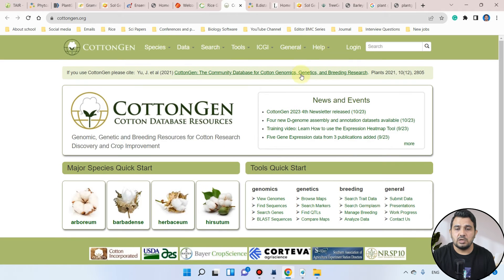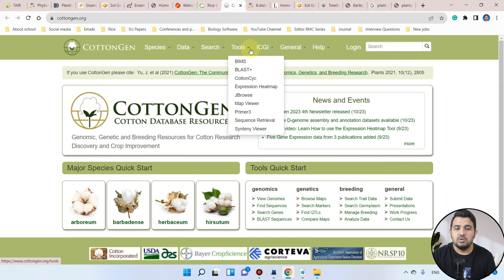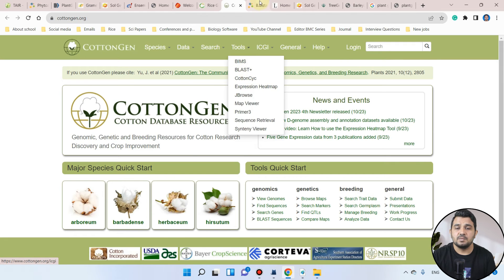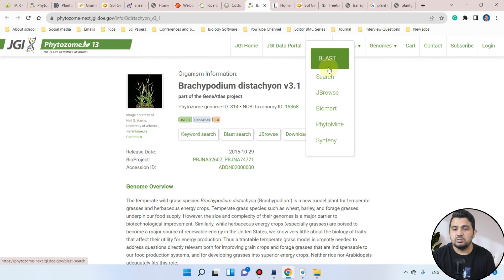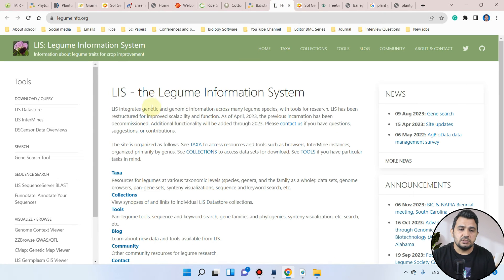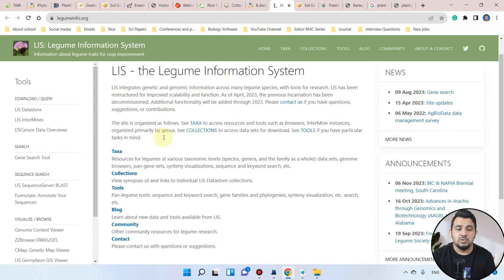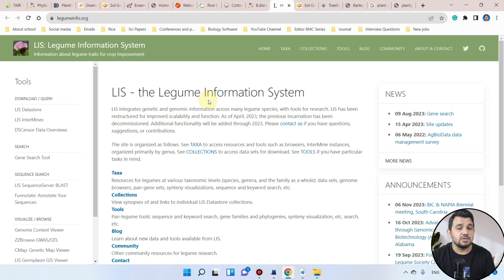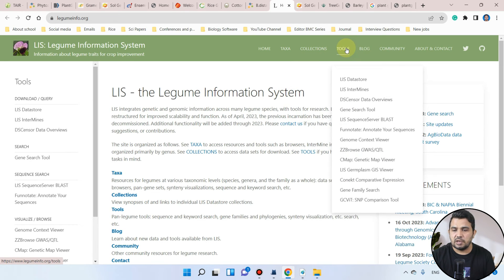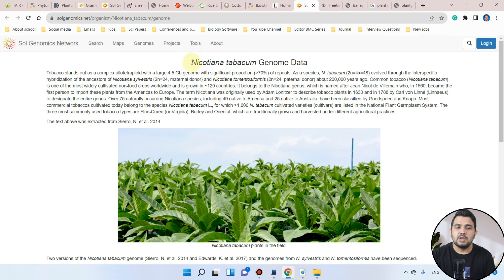If you are using the Brachypodium distachyon database, you can search it through Phytosome and again use the BLAST function. The next is the Legume Information System, where we have different tools. We will be using those for protein sequence extraction, including the gene search tool and the sequence server BLAST.